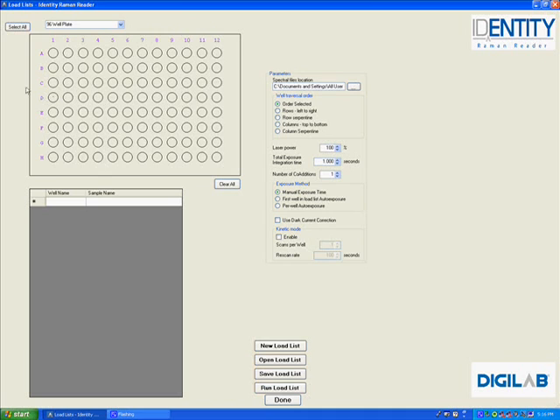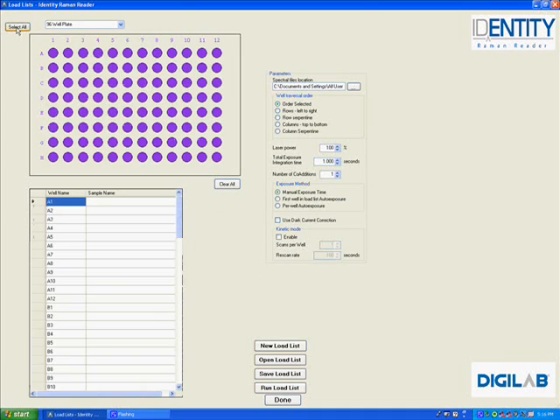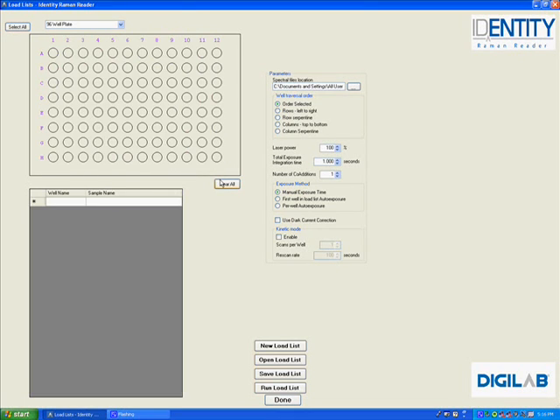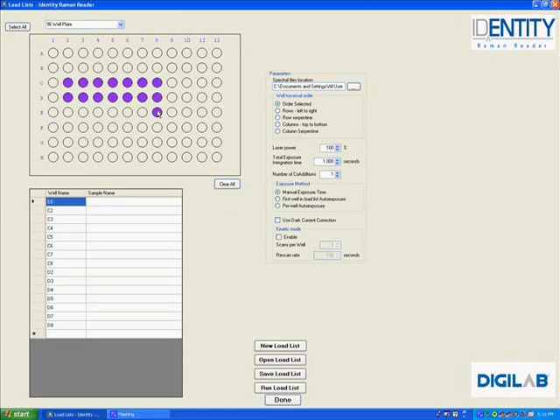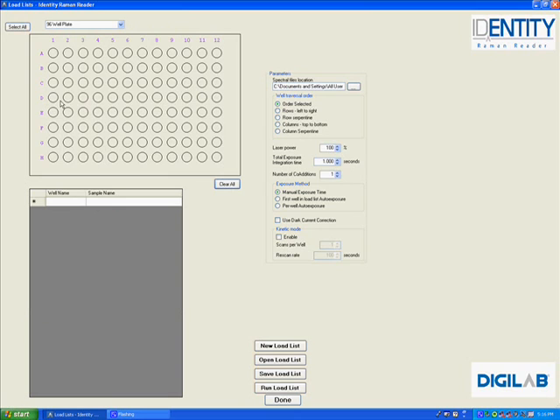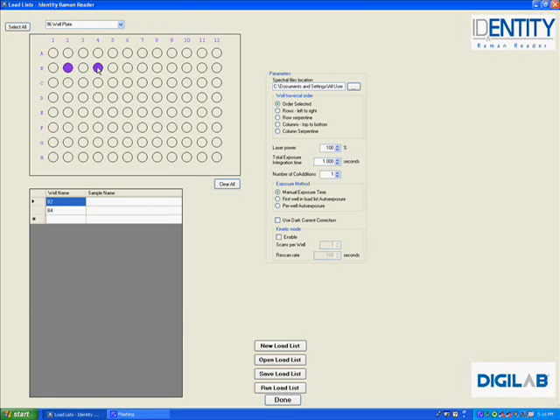The easiest way to scan all the wells would be to select all buttons, and all wells would be selected. If the user does not want to select all the wells, we can clear those, and we can either select wells by clicking and dragging with the mouse, or we can click on individual wells that we would like to interrogate.